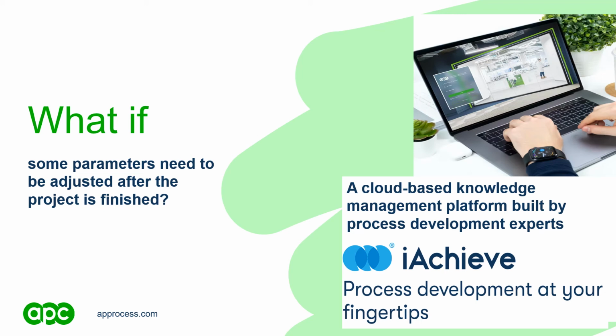I won't go into much detail about iAchieve today. I just want to mention that through iAchieve, we provide all the data, insights, discussions, and conclusions of all our work. And we also provide a report at the end of the project. Besides all that, we provide the web app through iAchieve, so you can also go through some of the models yourself.